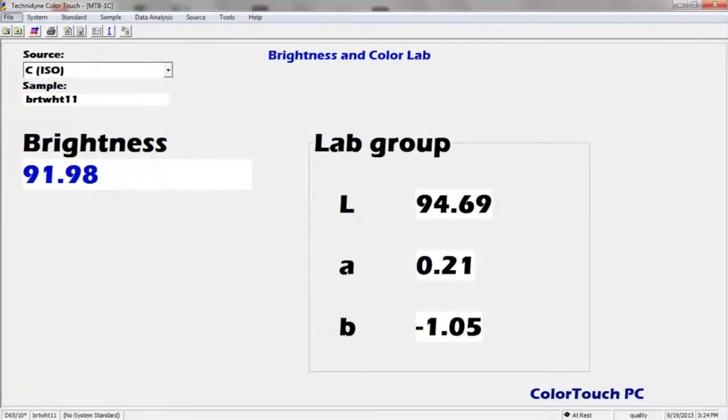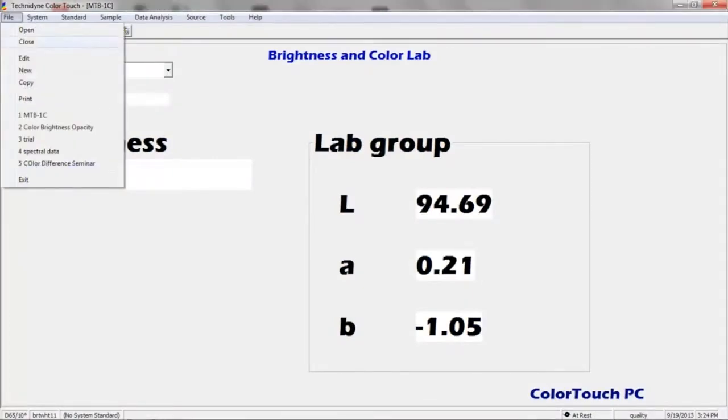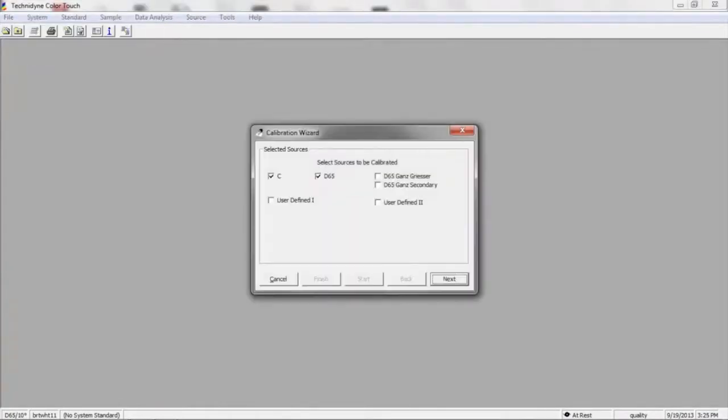You want to make sure that all measurement presentation screens are closed, so we'll go to File and select Close. From this main screen, we'll go to System and Primary Calibration. Here we'll just press Next since C and D65 are the default preferences. Go ahead and push Start.